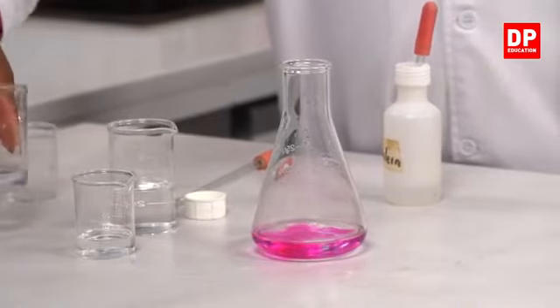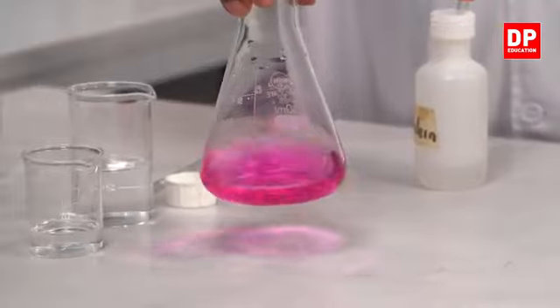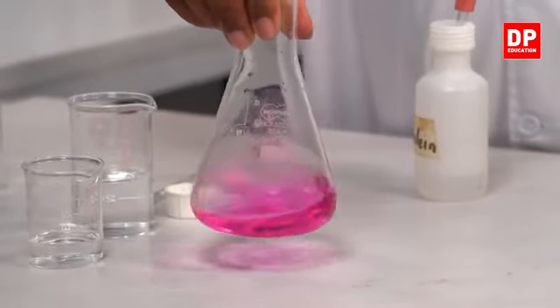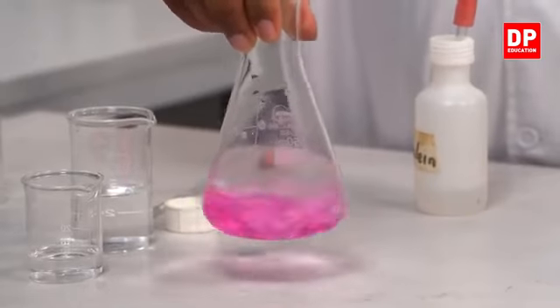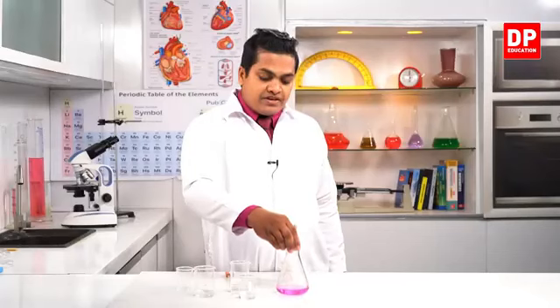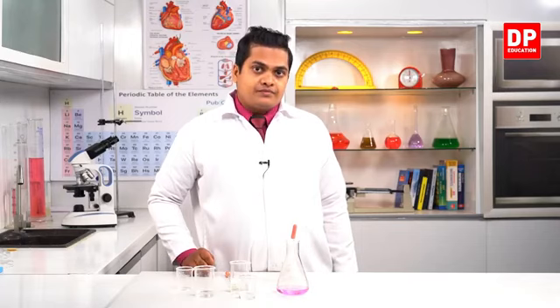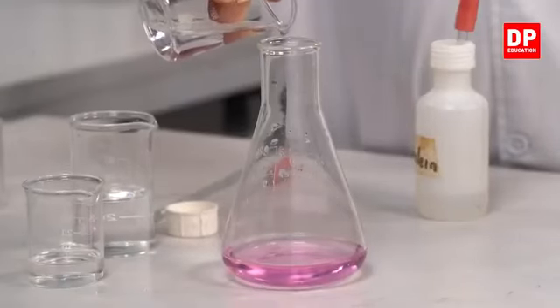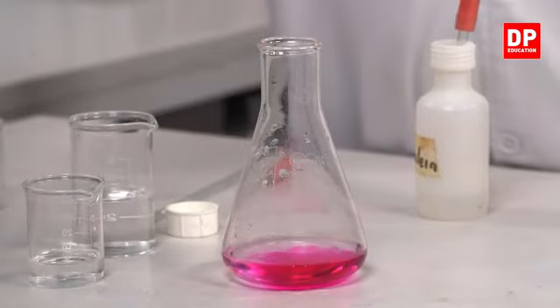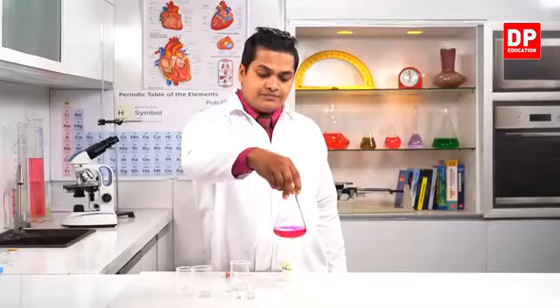See, as soon as I add sodium hydroxide solution once again, the color is going to reappear. See, once again the color is reappearing. It means that once again the basic nature of the solution is turning back on. If I add more, then once again it will take the initial dark pink color.